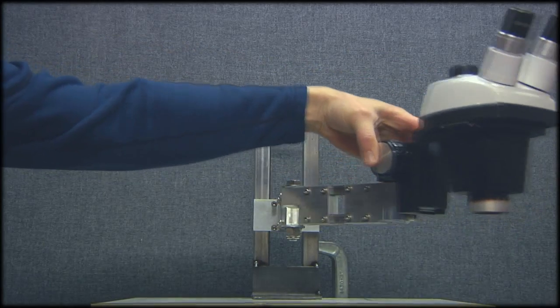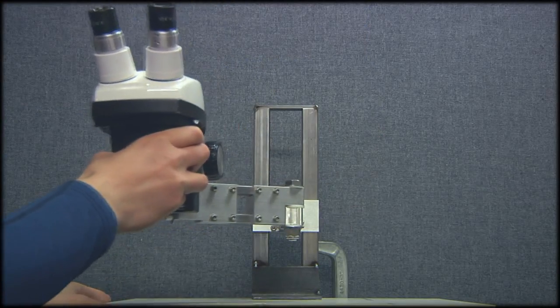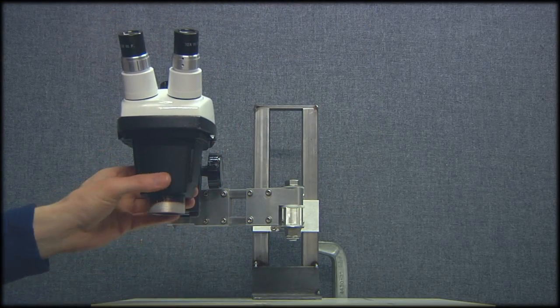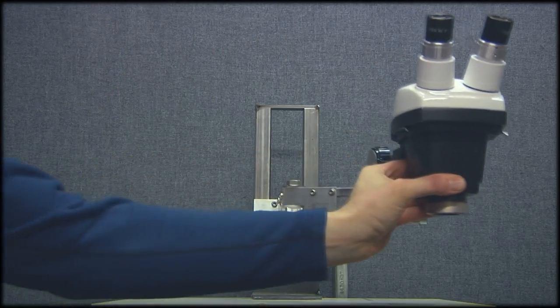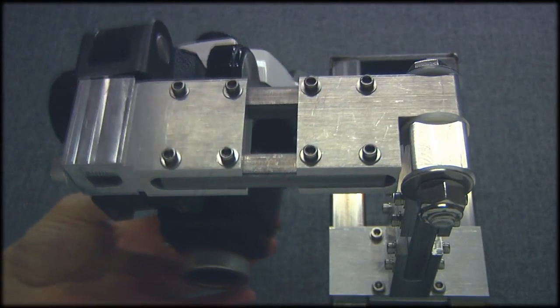I used some on-the-fly engineering techniques, some rapid prototyping, and pretty much all of my machine shop skills — from manual machining, CNC machining, welding, did a little bit of lathe work — pretty much hit all the machine shop tools.